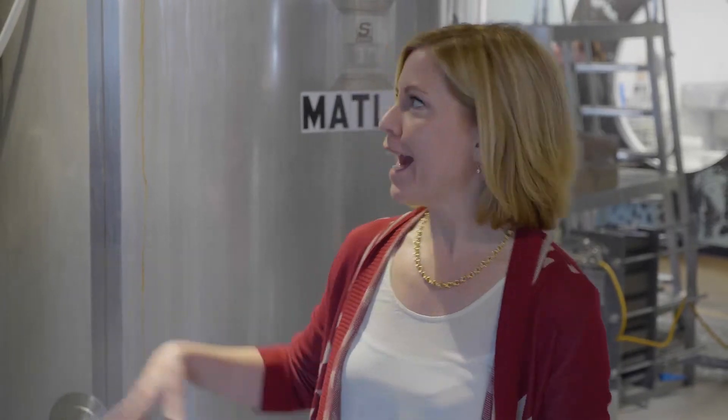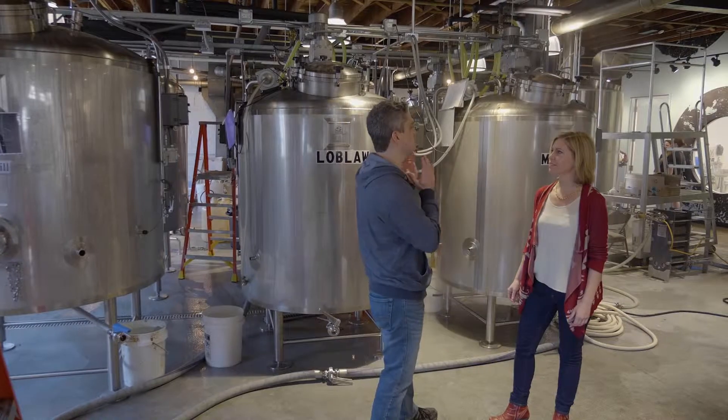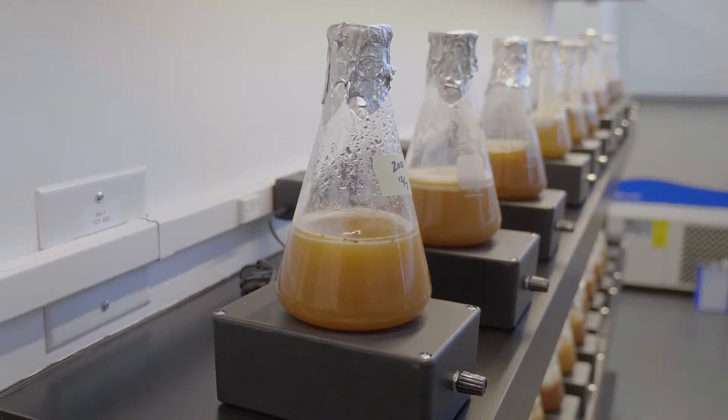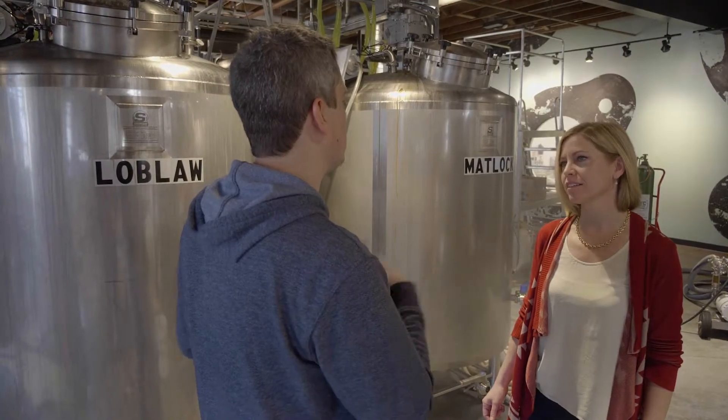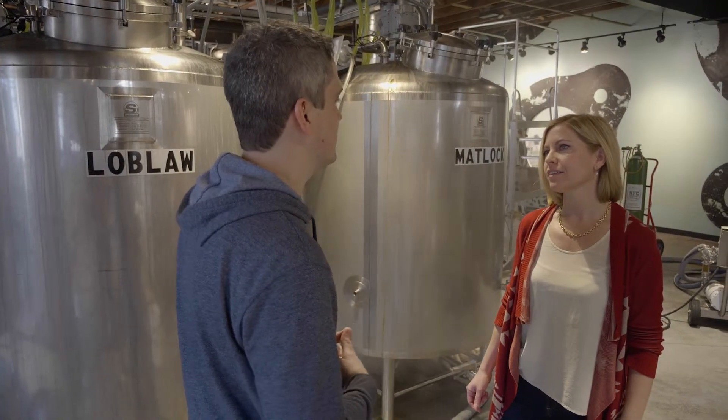So when I first came in and we walked into this room, I thought all of these were standard brewing tanks, but they're not. This is where the yeast is really starting to multiply. Right. This is where we get the big numbers — it's a giant version of what you saw in the lab. It's just a big tank, and instead of a little magnet inside, we've got a giant fan pushing things around and scrubbing the CO2 out that the yeast is producing. It keeps them in contact with the nutrients so they'll grow faster and to a higher cell count.